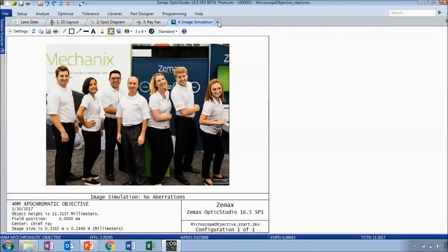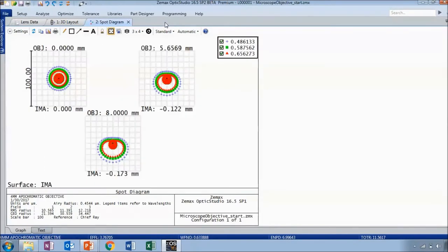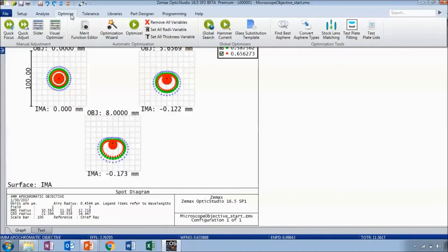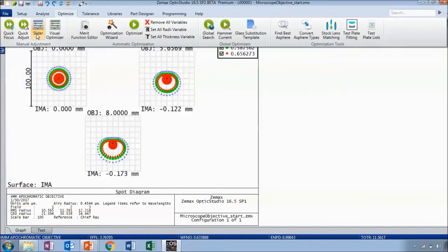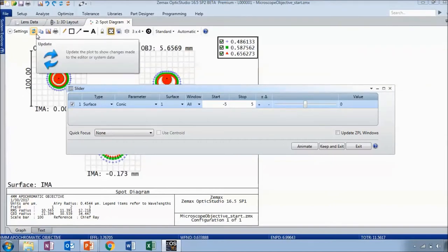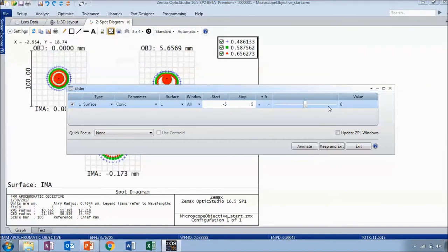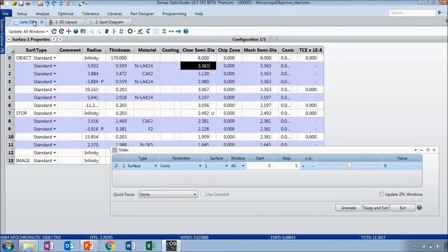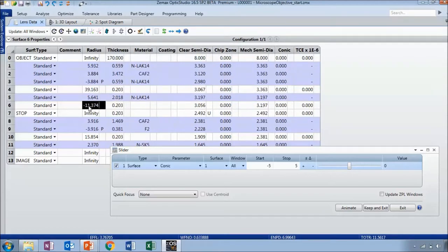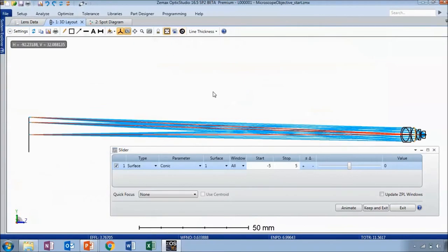We've got a good feel for how our system is performing, but let's try to optimize it. We're going to move over to the optimize tab and start with some manual adjustment tools. We already looked at the quick focus tool, but now let's try the slider. The slider tool allows you to drag a slider bar to adjust one of the parameters in your system. Let's look at the surface 6 radius of curvature.